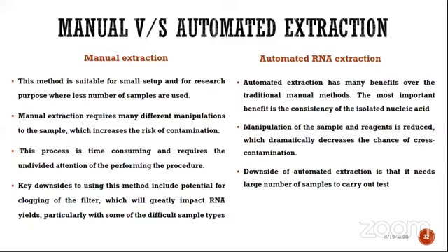You are not pipetting multiple times. You are not using Eppendorf tubes. Because we open the Eppendorf tubes multiple times, we usually change our gloves after at least two steps: after one washing, we have to change the gloves, and after addition of the sample, we have to change the gloves. So the most important thing is the consistency of the nucleic acid, and I think the automated extraction machine has that benefit.